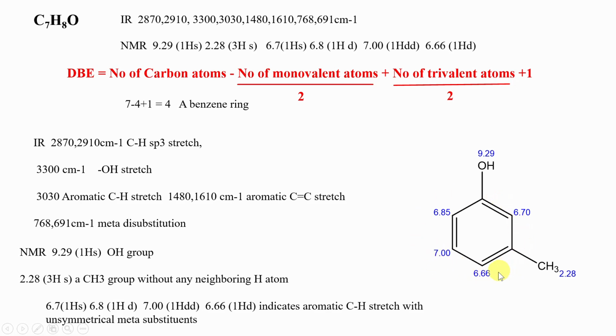So these four carbon hydrogen bonds are different, and hence give different signals. Okay, so the molecule with C7H8O is nothing but metacresol.